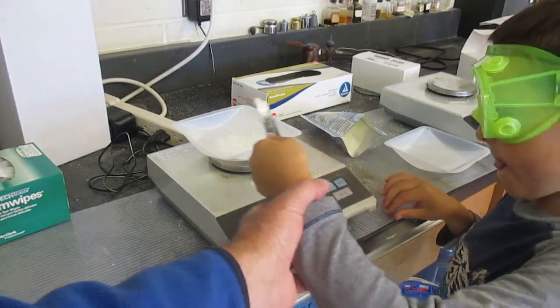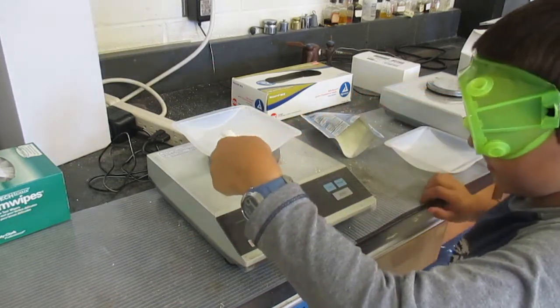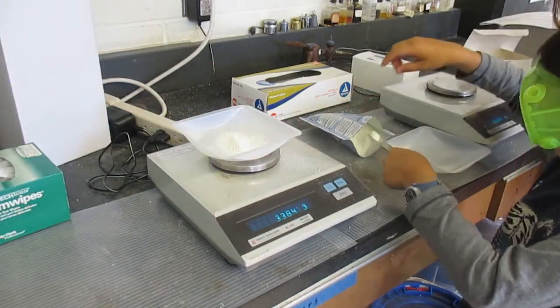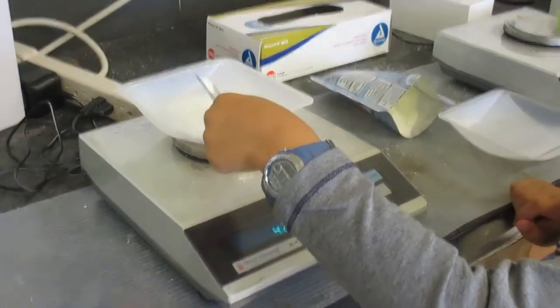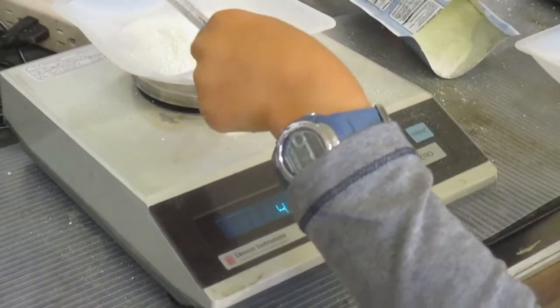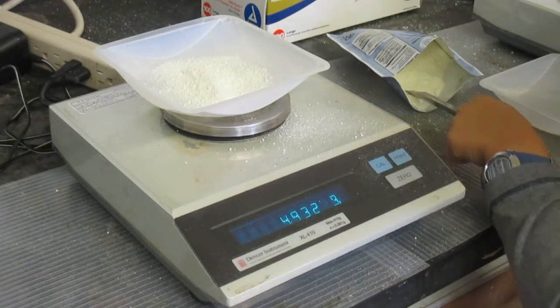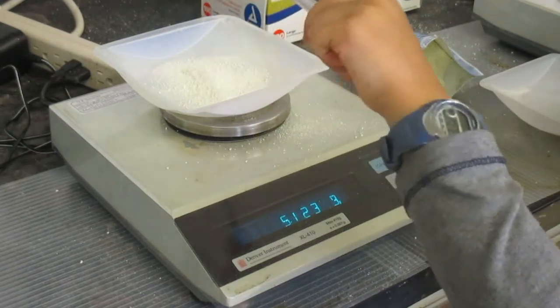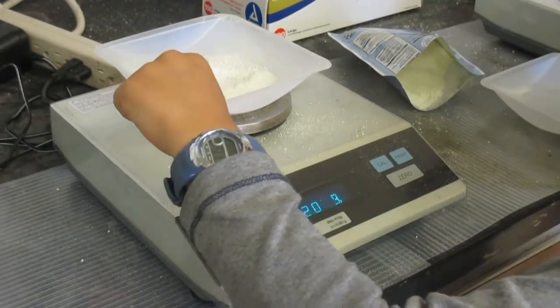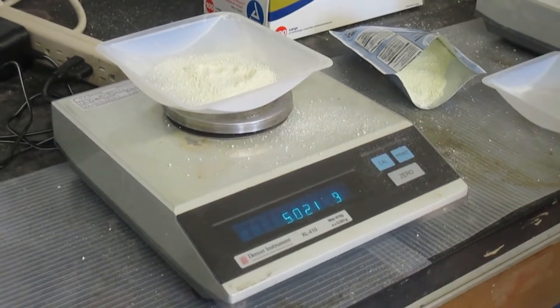I think you can dump it a little bit faster. You need 5.0, right? So get some more. All right, you guys are doing very good. You're not making too much of a mess. See, you're not even there. 3.3 is where you're at now. We're getting close. Yep, getting close. Oops, now I got to take a little bit out. Good, that's a very good amount. We can live with that. All right, so he's got 5.021. We'll see what Ezreal is able to scoop out.